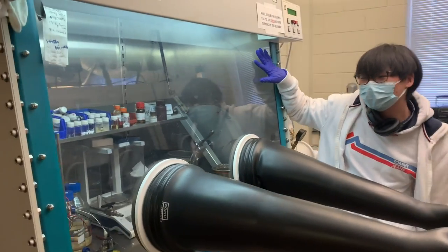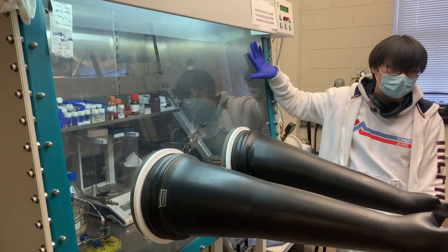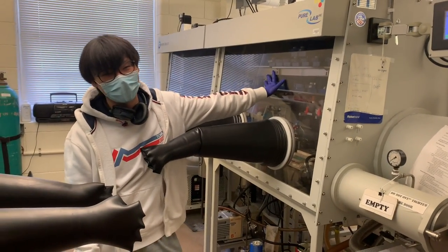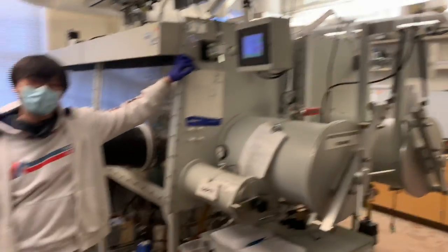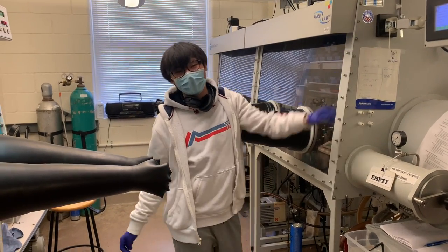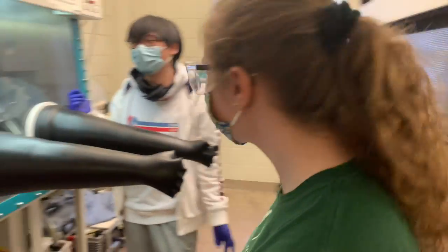Here is a single glovebox mainly used for the electrochemistry away from laboratory atmosphere. And this is a double glovebox, mainly for organic synthesis. Standing behind is another double glovebox for reagents that are water-sensitive but air-sensitive as well. Now Tiana will show you some examples of working in the glovebox.